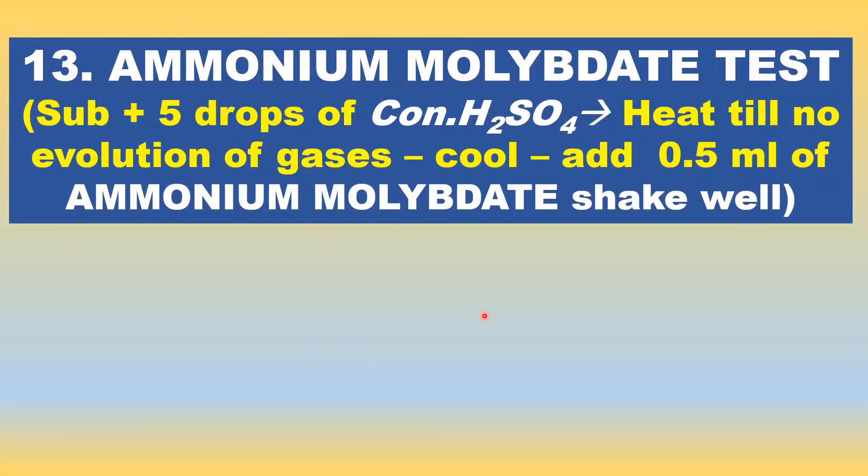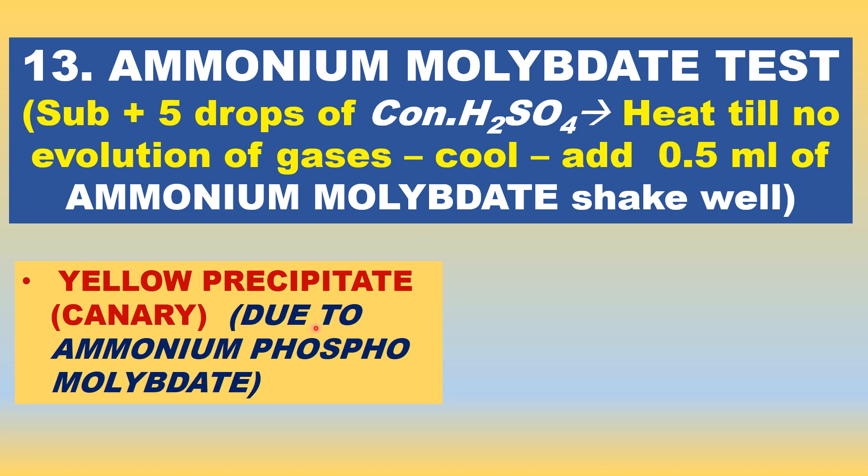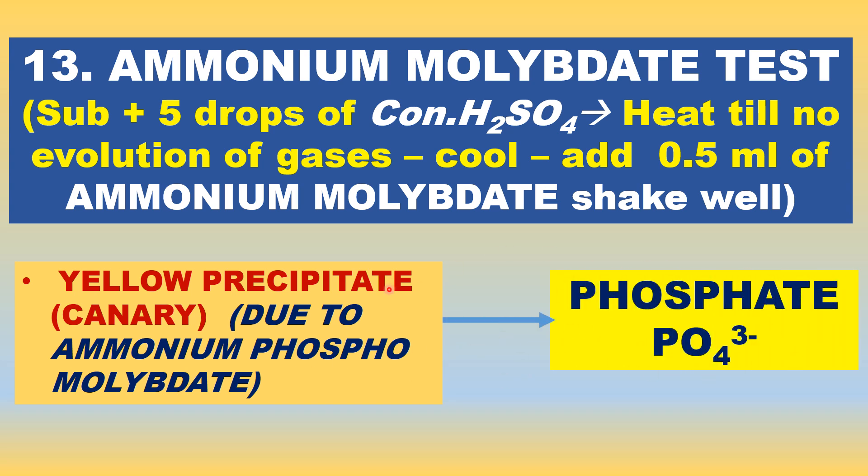Let us see another important test for phosphate: the ammonium molybdate test. A small quantity of substance is taken in a test tube. Five drops of concentrated sulfuric acid are added and heated until no gases are evolved. Then cool it for one minute and add 0.5 ml of ammonium molybdate solution and shake well. A yellow precipitate is formed, indicating the presence of phosphate salt (phosphate acid radical). It is due to the formation of ammonium phosphomolybdate, which gives a yellow precipitate.